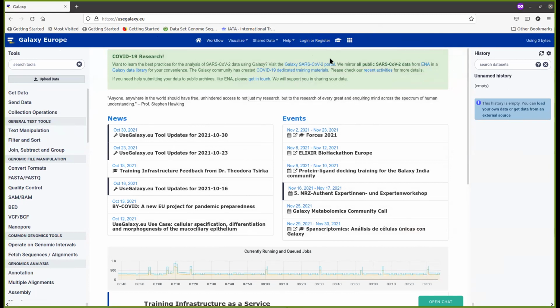The other Galaxy link, which other Galaxy link? .org. Sorry, so you register here. Use galaxy.eu. Okay, this is the website that I'm looking at. Just moving things around my screen. So this is usegalaxy.eu. I don't understand your question, Mishak.